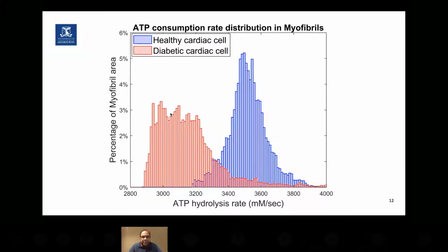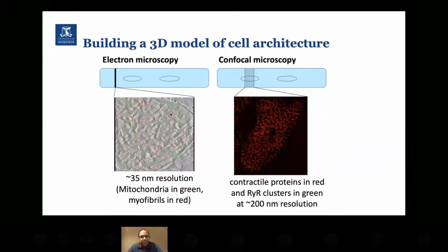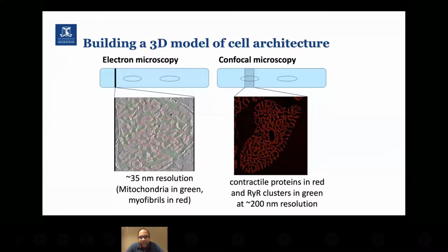So that's sort of having shown you what we can do with these models, and particularly when we use them in conjunction with electron microscopy. The last thing I'll also mention is that we've been in this area of wanting to build models from electron microscopy data for quite a while.